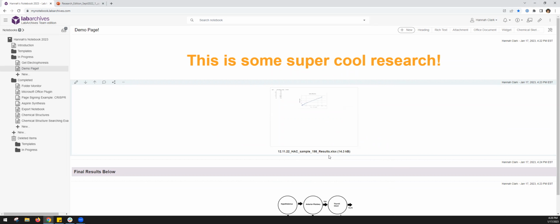Now, whether you can actually use that file, whether that is useful, is a great question. So let's say you have some strange proprietary file format and the software you use expires, discontinues, whatever. That's where I would probably recommend that you use the most common file formats available to you. This can be tough depending on the applications that you have. It's part of good data management and good research to use common file formats as applicable. So text files, images, PDFs, Word, Excel, PowerPoint, things that will be good for a number of years.